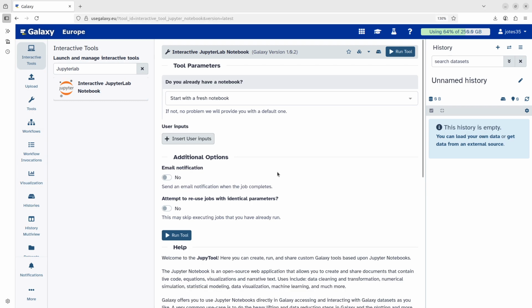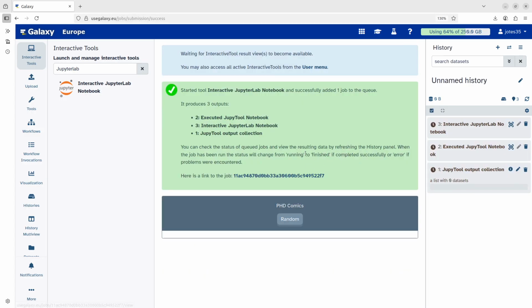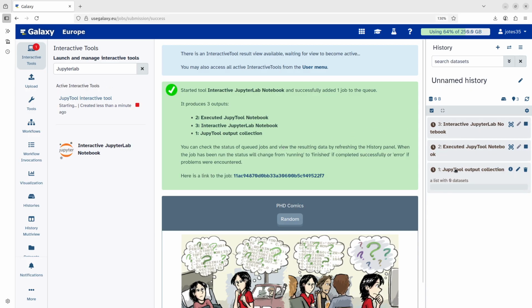All right. Now, what we are going to do is to just click on Run. Once we click it, it's going to open the programming environment for us. Typically, we have to wait for some time. You will see that this is gray. We just have to wait until the environment becomes ready. Here it says it's starting. We just have to be patient and wait for it to get started. It should take less than a minute to load.